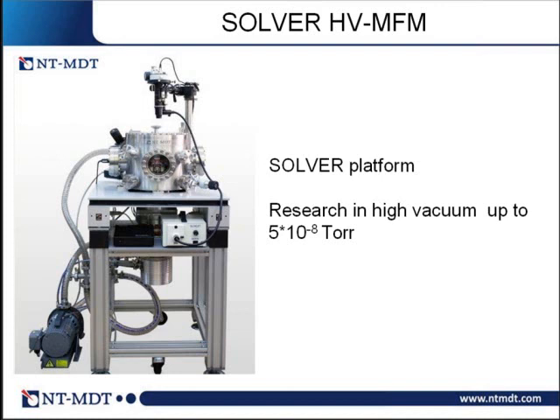To avoid that, it is necessary to use a high vacuum device, and at pressure in the regime below 10 to minus 8 torr, the moisture or growth of ice on the surface of your sample is not so important, so you can work several tens of minutes up to 1 hour without disturbance of the interface.